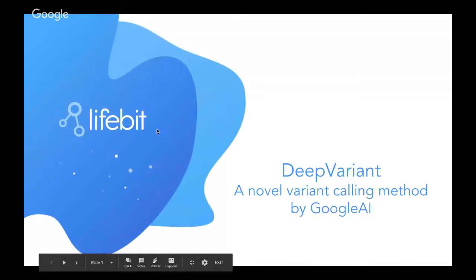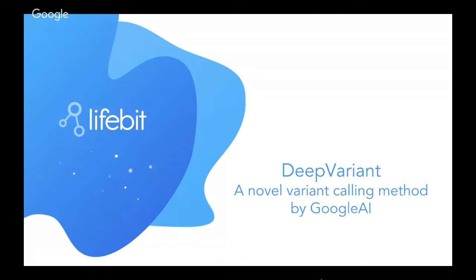As some of you will already be aware, DeepVariant is quite a good tool that was developed by Google's team, the Google AI team in this case.